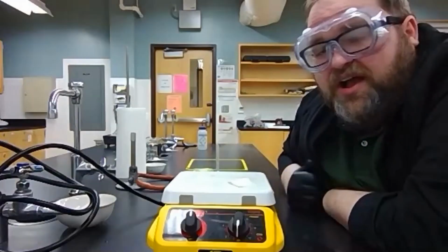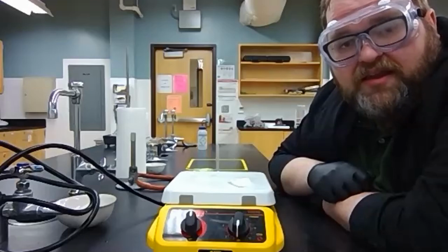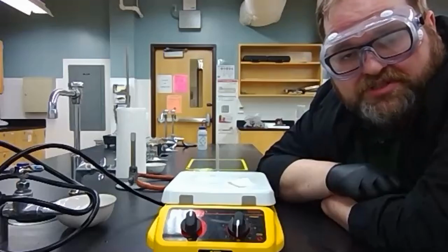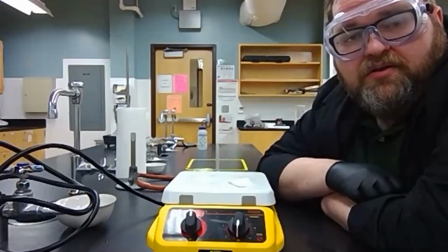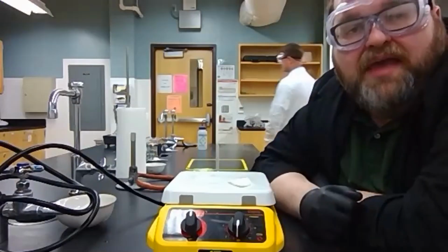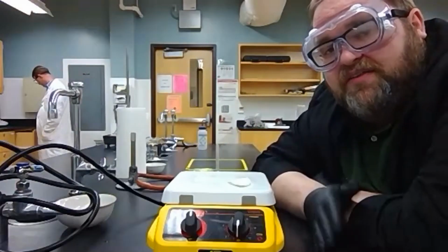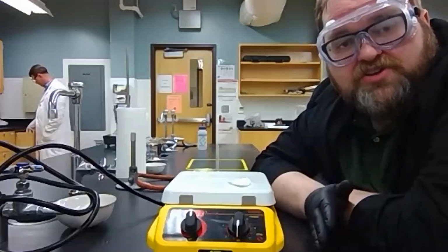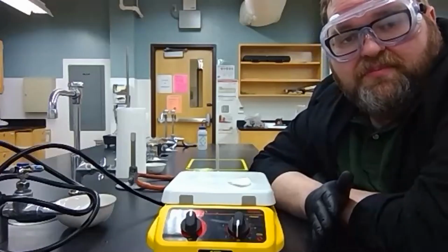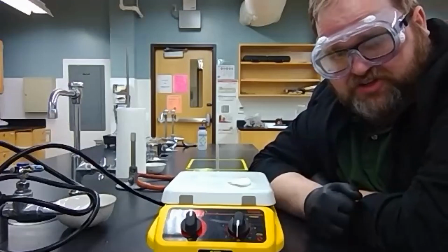We've waited. It's dry. I'm not going to show you this, but we are going to then take this filter paper with the sand, take it gently off using a set of crucible tongs, and put it onto our watch glass to cool down to room temperature. At that point, we're free to obtain the mass of the watch glass, the filter paper, and the sand. The mass of the watch glass, the filter paper, and the sand, minus the mass of the watch glass and the filter paper, is equal to the mass of the sand. The mass of the sand divided by the mass of the mixture times 100 tells you what percentage of sand you had in your mixture.